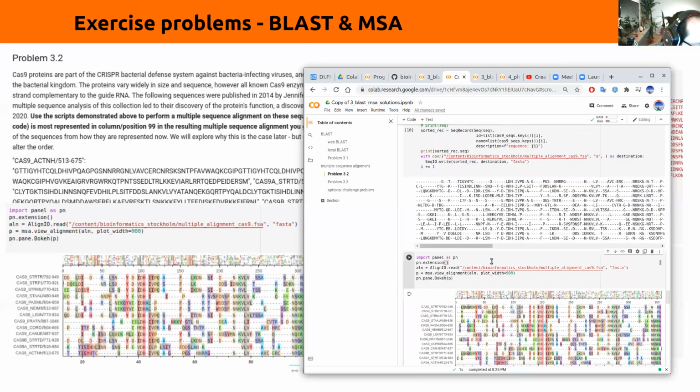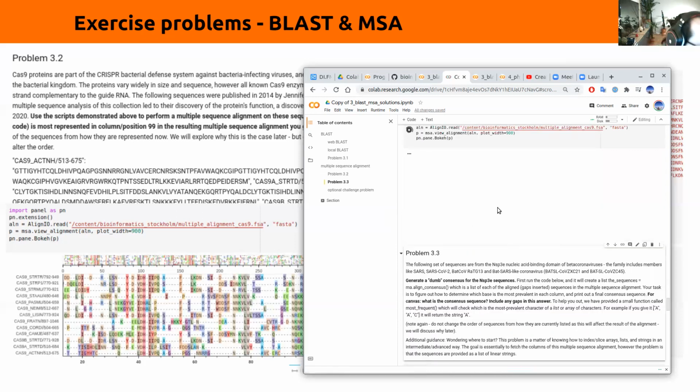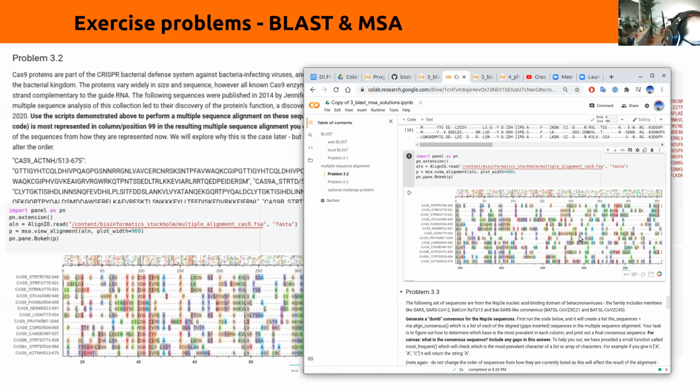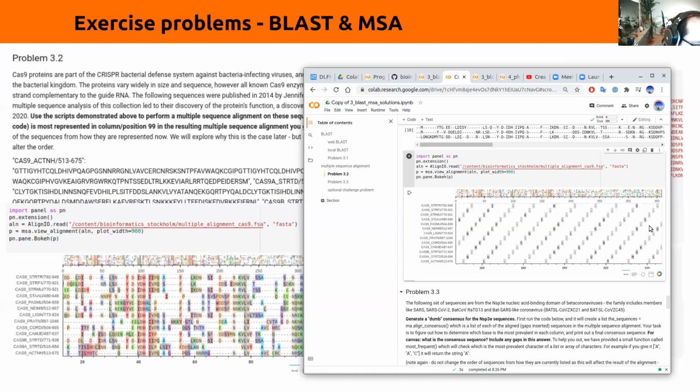And this last panel down here is all about visualizing the same information. So no new information is really added here. This additional step, running another function, view alignment, is utilizing some graphical libraries in Python to create this interactive plot. And if you click it, you can drag it and scroll through, as you can see. And we've color-coded the residue types according to amino acid, to better visualize it.